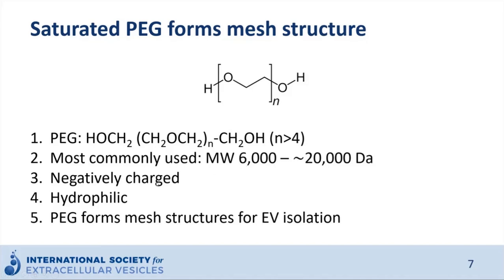PEG is negatively charged and hydrophilic, which means that it is soluble in water. PEG with proper concentration can form mesh structure to capture particles, which leads to their aggregation.